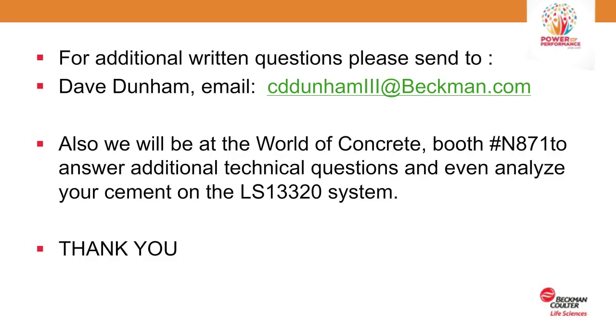That's great, all those resources. Another person asked, how many samples can I run in a day? If you're running dry, that's going to be the quickest way, since you're not having to rinse the module. Your typical analysis time might be between a minute to a minute and a half per sample. So you could run 40 samples in an hour running dry, if you have samples available and ready to feed.